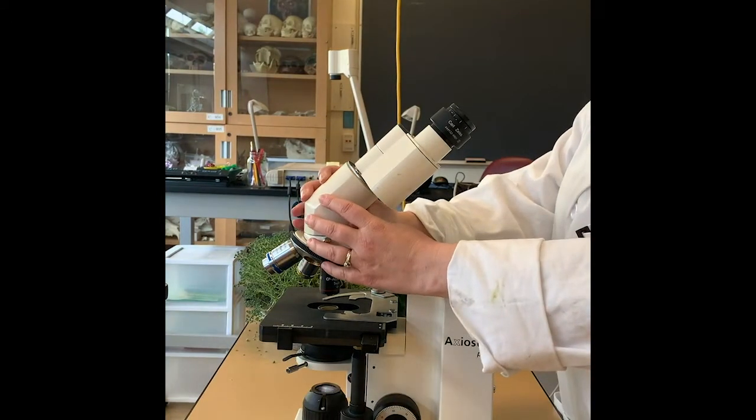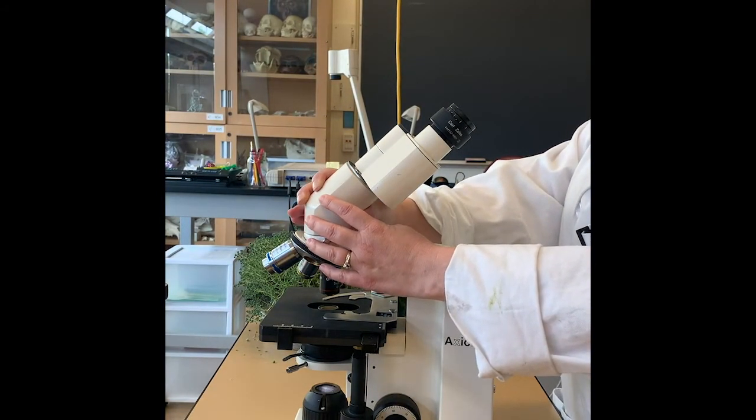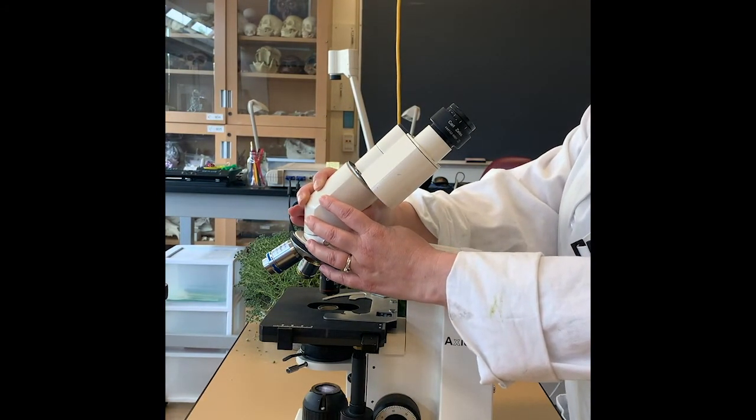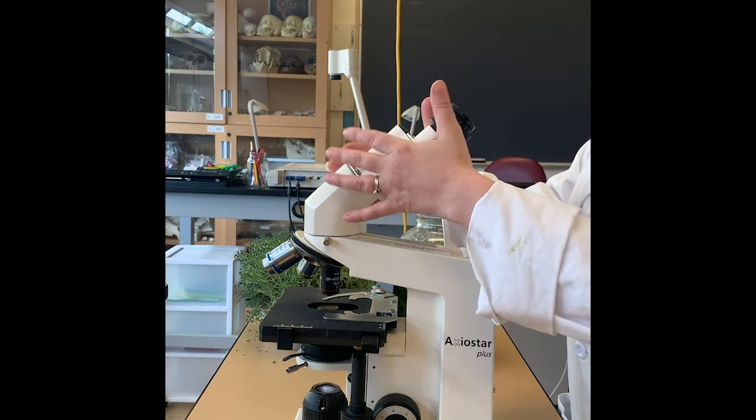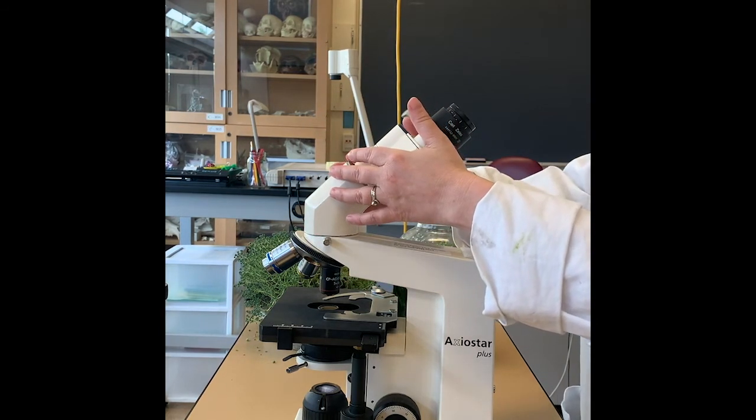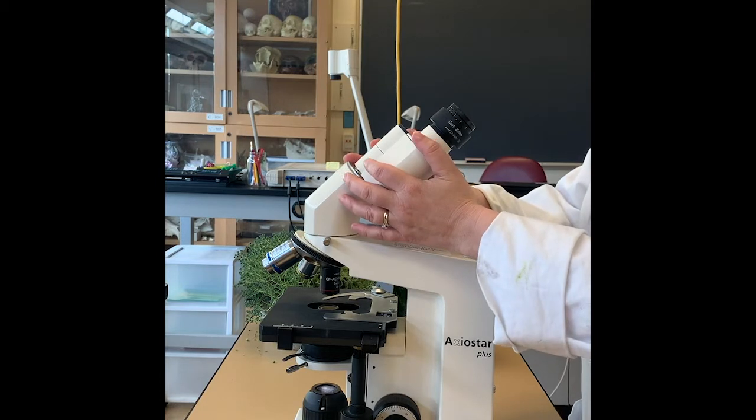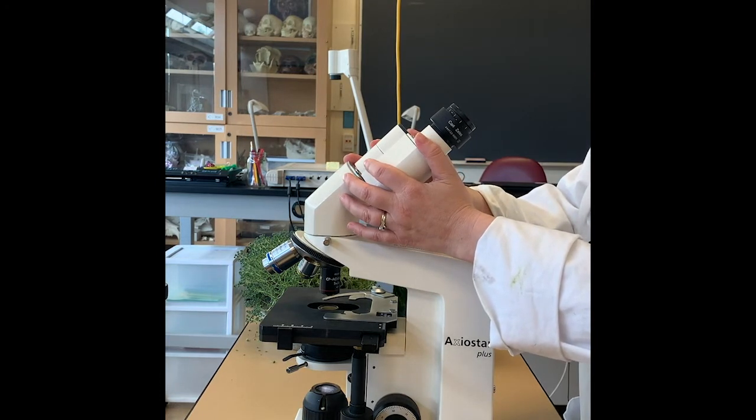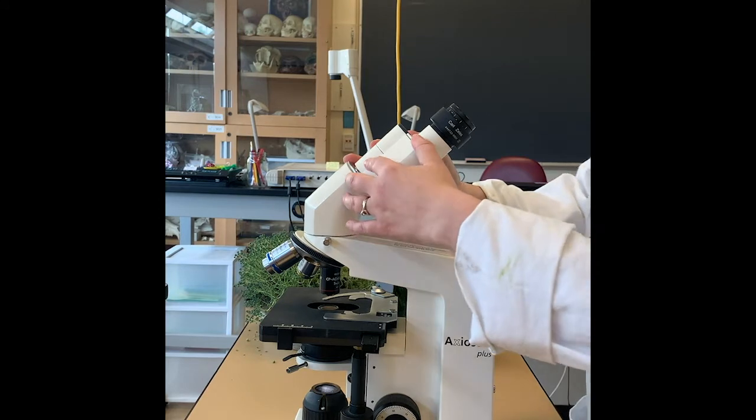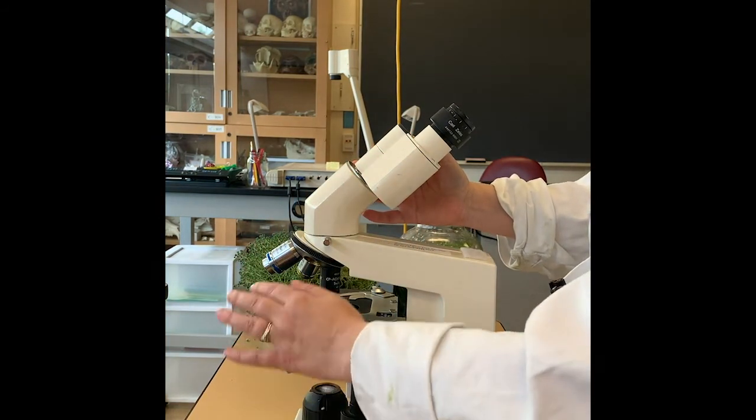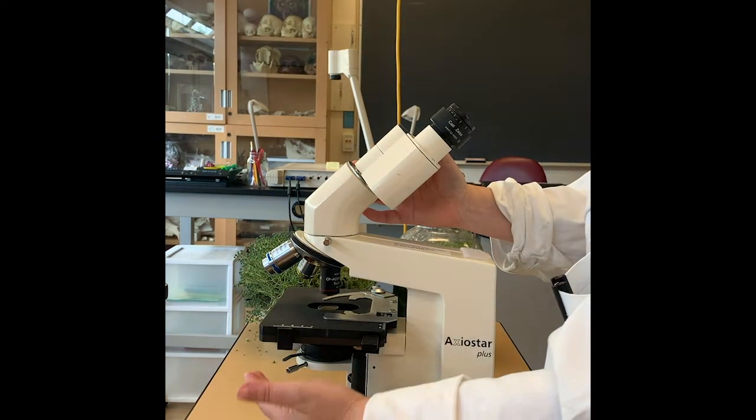The top part of the microscope that holds the ocular lenses can be used two different ways. It can be used the way we have it right now, facing away from the controls. This way was traditionally used in the situation where you might want an external light source shining down on your specimen or shining up on it.